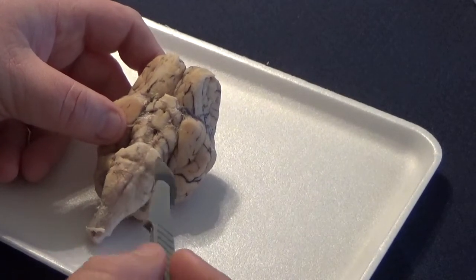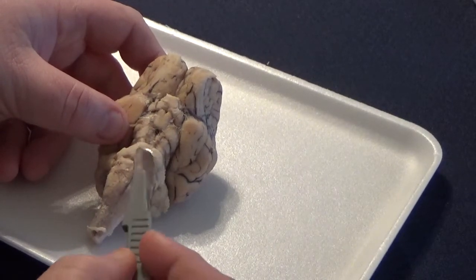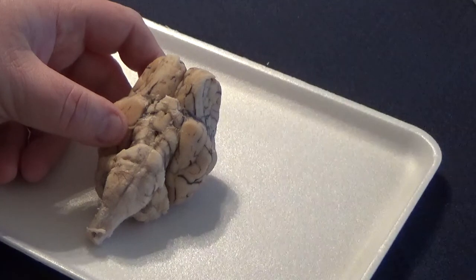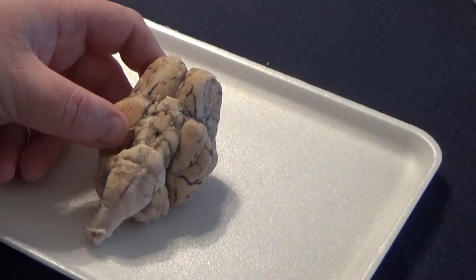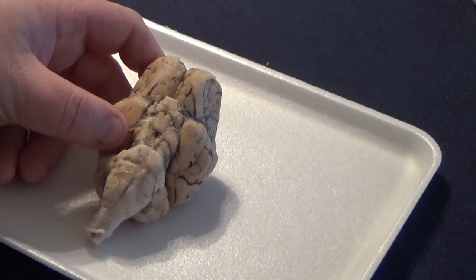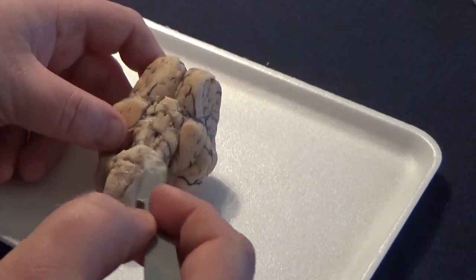If we go down, there's these bumps at the bottom, or at the top, excuse me, at the top of the brainstem. These are the pons. So the pons are these bumps here. The pons controls sending messages from the brain to the rest of the body, particularly messages about fear, decision making, and that kind of thing. In other words, if the sheep sees a predator, its brain's going to send messages through the pons.